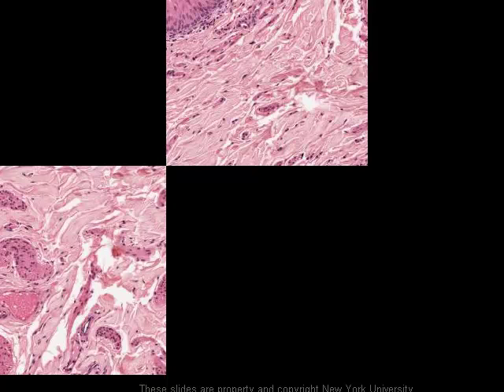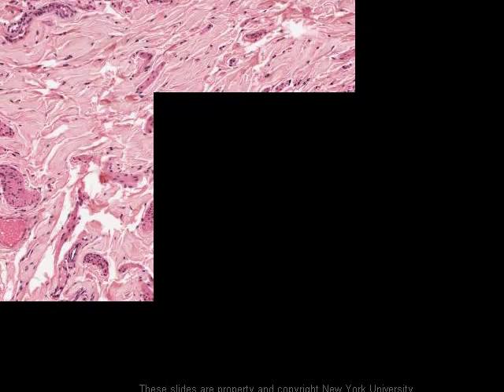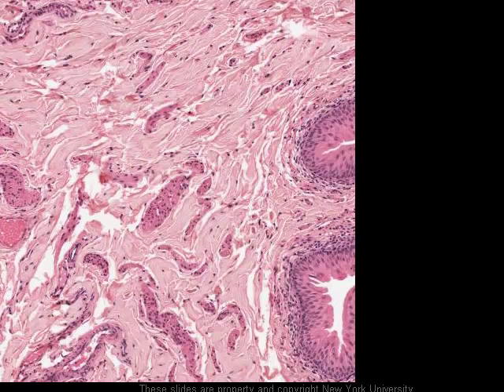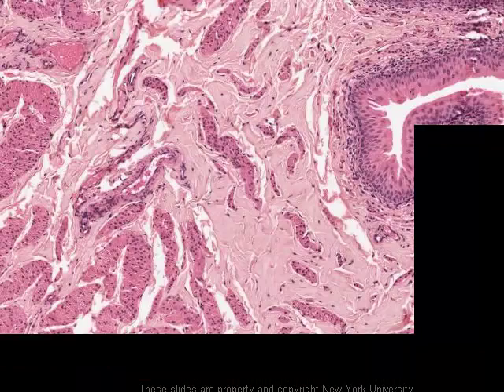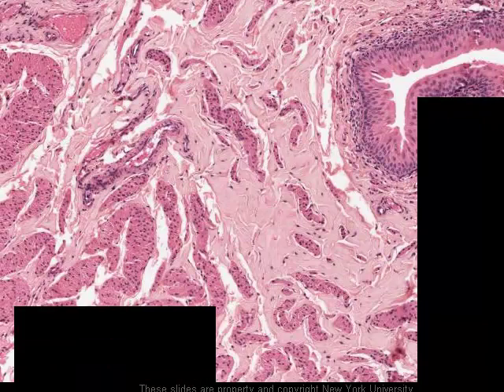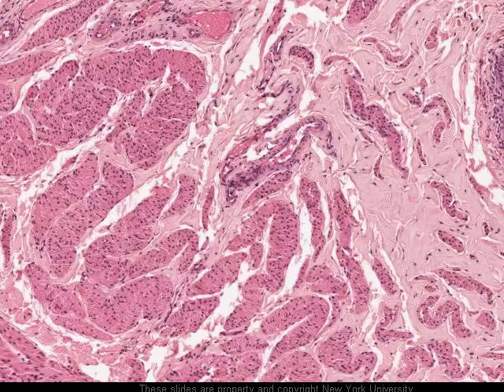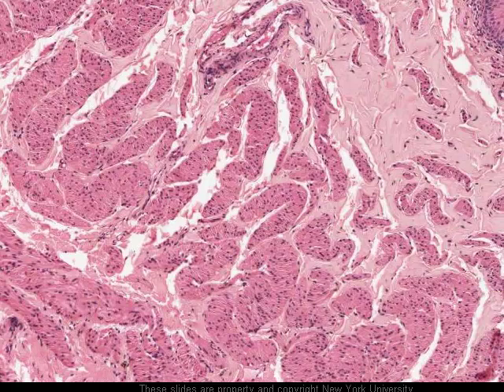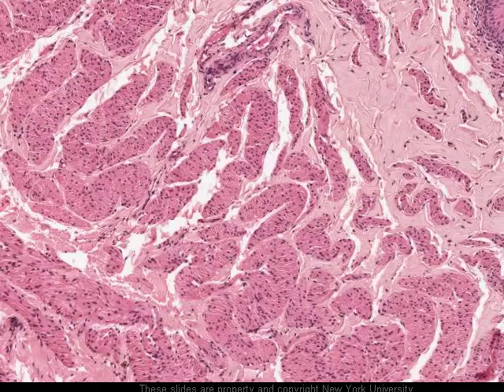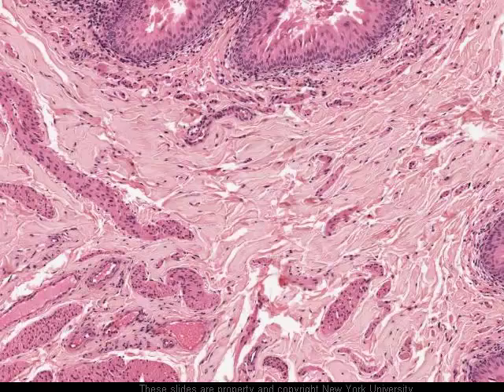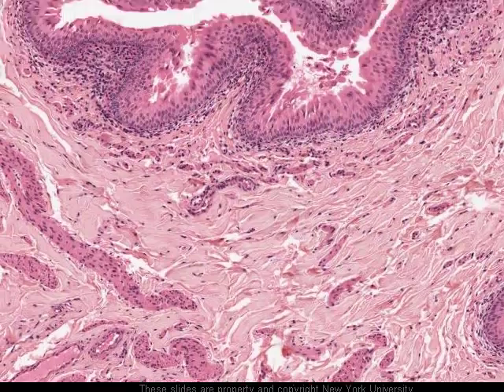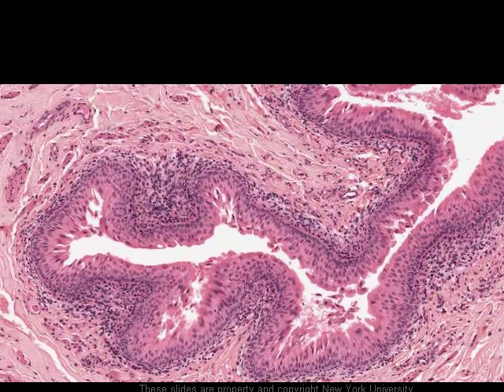Moving outward through the dense irregular connective tissue submucosal layer, encountering more blood vessels, we eventually begin to encounter the smooth muscle that forms a very large part of the wall. Here's the smooth muscle, cut in cross-section and oblique section, with bundles of smooth muscle in very dense connective tissue. That, essentially, is the structure of the urinary bladder.